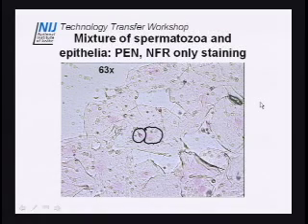Going to your question about thickness, you could see something like this sperm here. It's right next to an epithelial cell nucleus, and I probably wouldn't cut something like that. Instead, I would try to cut something like this.